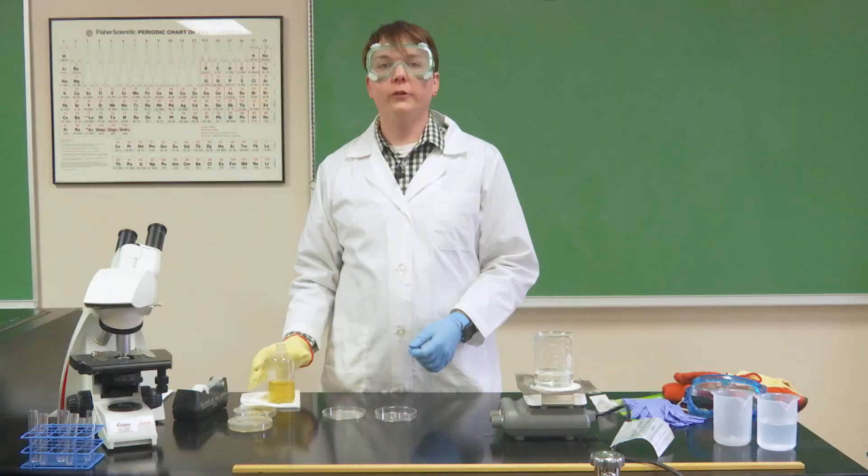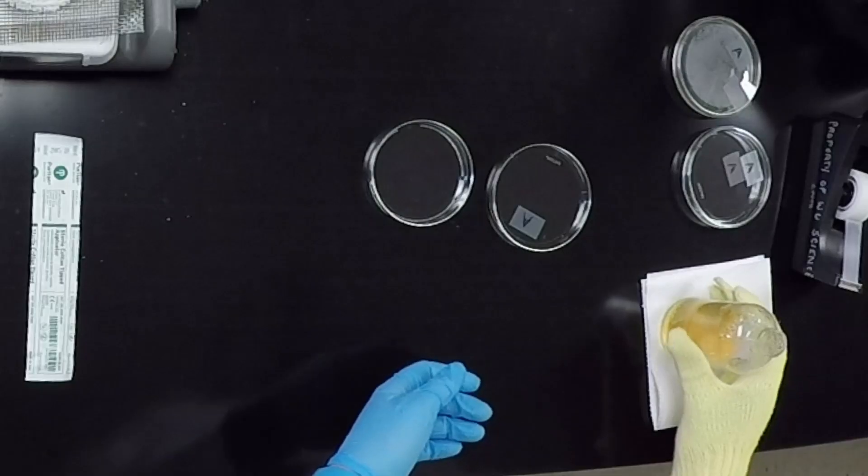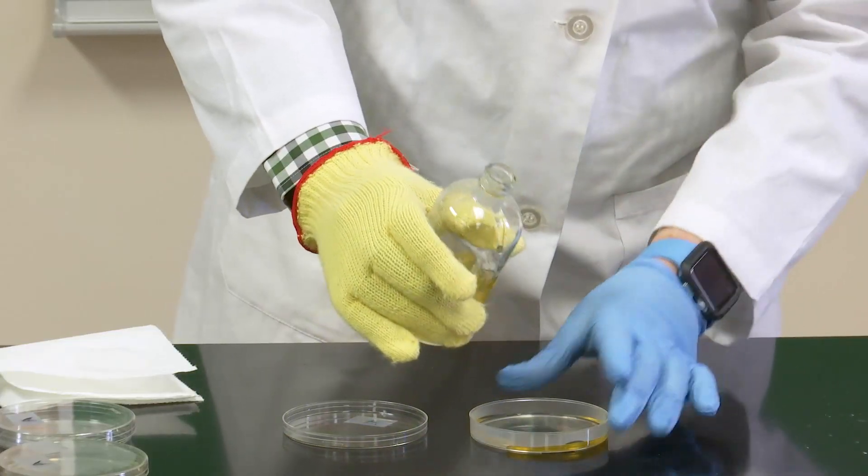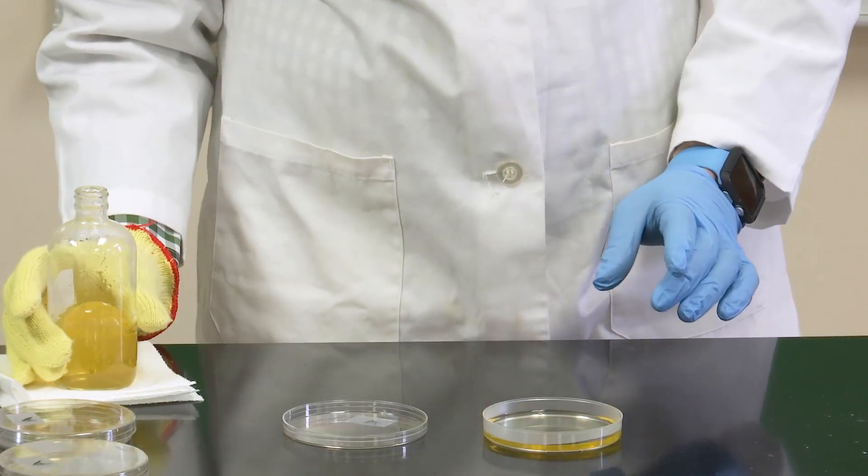Allow it to cool for a bit until you can safely pour it into each petri dish. You will only need a thin layer that coats the entire bottom of the dish. Give it a couple minutes to rest and cool. It will harden into a thick gel.